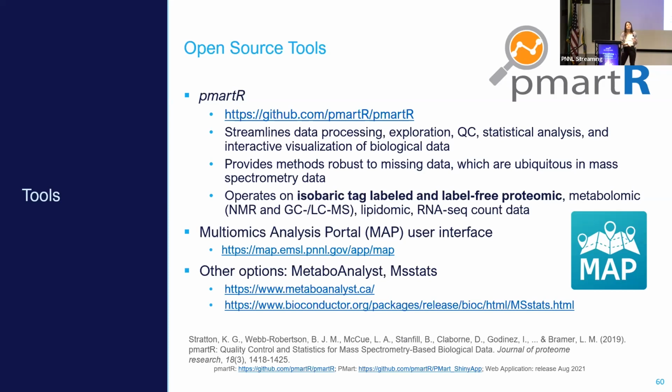I've worked on a metabolomics and lipidomics project in the past where we were obtaining samples from a larger consortium, from different sampling sites. When we got samples, we'd run them on the mass spec. I would get the data, process them, and we were trying to pull out any metabolites or lipids that were signatures of a disease. And we kept finding that there was one metabolite in particular that was sometimes super abundant and sometimes not.